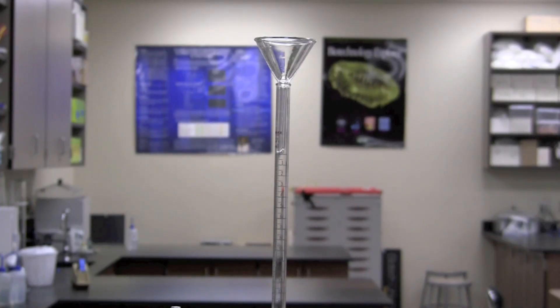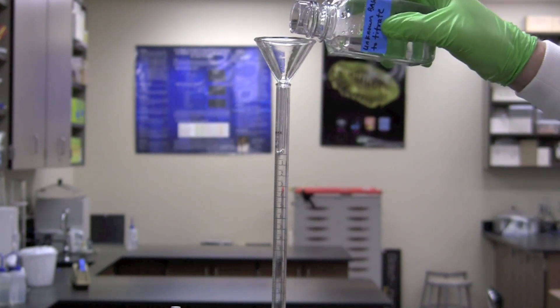Using a funnel or pipette, fill the burette with the base of unknown concentration. In this case we are using a sodium hydroxide solution. The final amounts can be added drop by drop using a pipette. Read and record the volume of sodium hydroxide in the burette by reading the bottom of the meniscus.